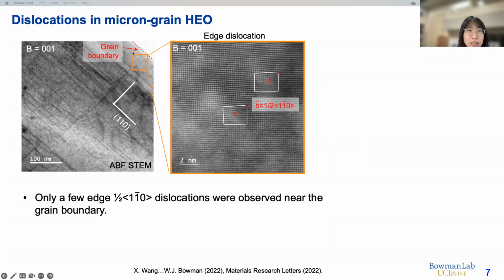As we discussed earlier, the dislocations usually appear as very straight dislocation lines, and they were on the 110 planes. These 2 perpendicular 110 planes are marked by these 2 white lines. The dislocations seem to be parallel to these 110 slip planes. And we also notice there are few edge dislocations, and most of them appear as screw dislocations.